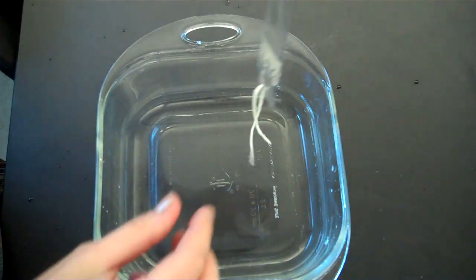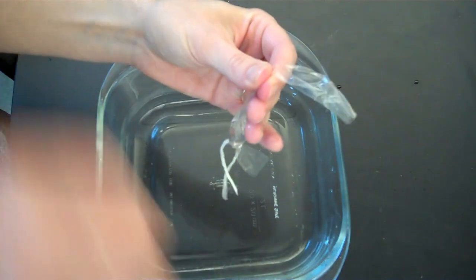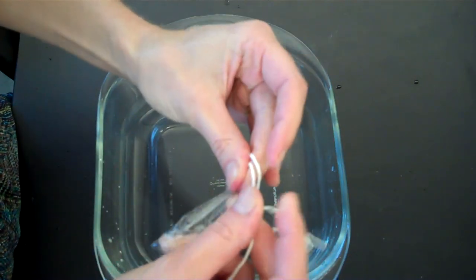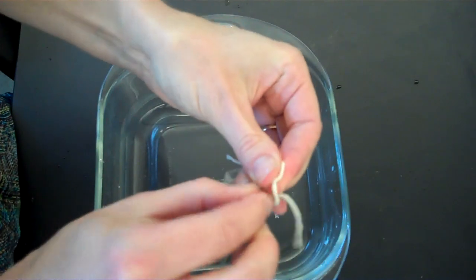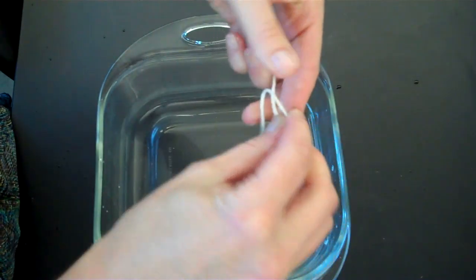Once the tube has the liquid, go ahead and tie the other end with a second piece of string. Try and avoid getting too much air in there, and try and avoid touching the tubing too much, because that transfers the oil of your hands onto the tube.